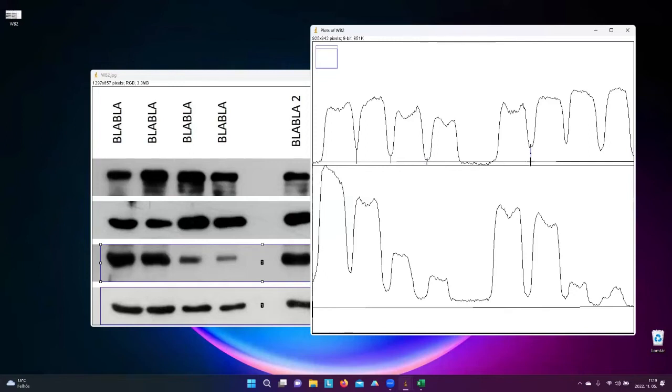Now you can ask, but hey, what's going on with the overlapping features? Because if you see, there should be some overlapping here and there. In this case, that is not part of the analysis which people call manipulation or fabrication.